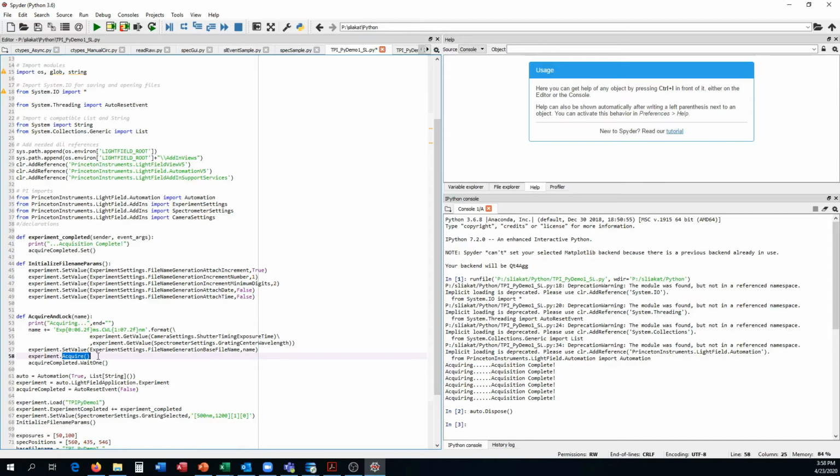So you can run this acquire and then program other hardware or arm something else via the software. And then when you've done everything you need, you lock the thread so that you don't put the software, or LightField specifically, in any bad states. You don't want to corrupt it.